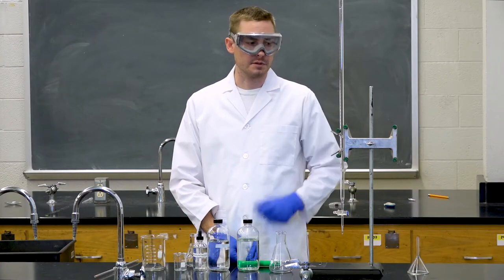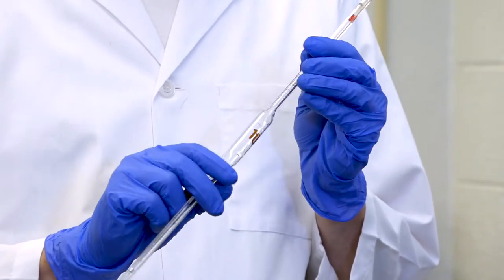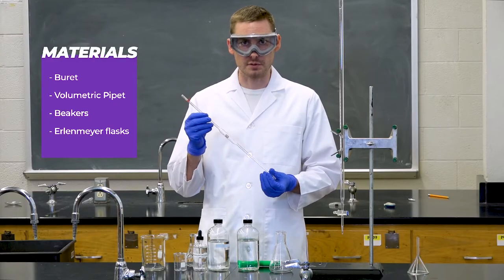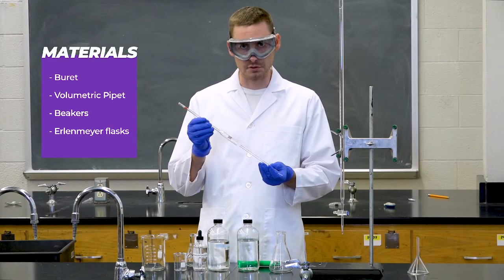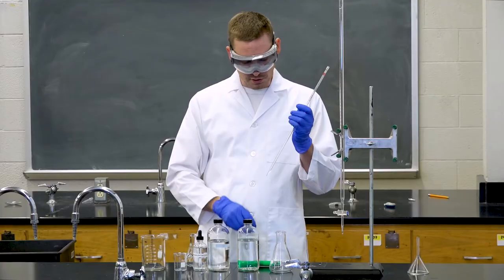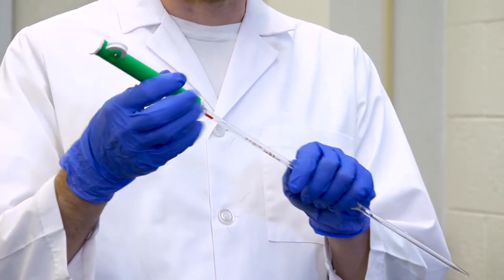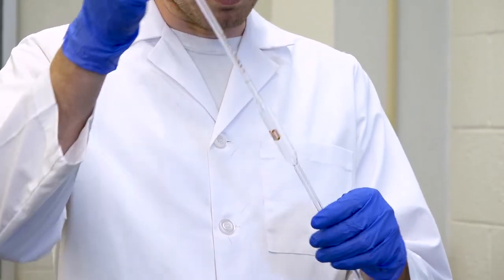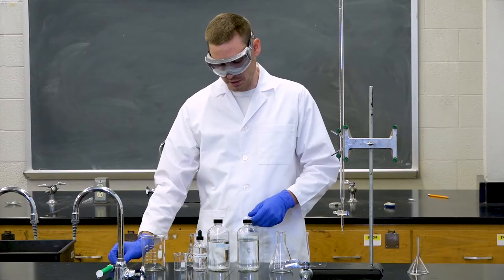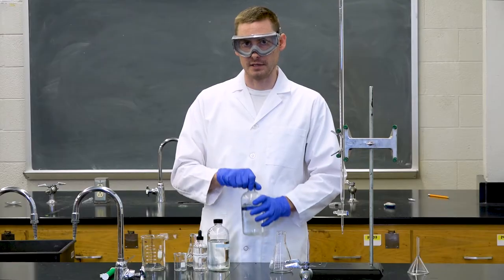For this lab, we're going to be using a burette and also a volumetric pipette in order to measure out the reactants for this reaction. In order to use a volumetric pipette, you first need to rinse it 3 times with your solution, so that way it's clean and so that the volumes will be accurate. To use a volumetric pipette, you first need to add a bulb or this pipette pump, and then you can draw up some solution from a beaker. You never want to draw up the solution from your stock bottle itself because you may contaminate it if you do so.